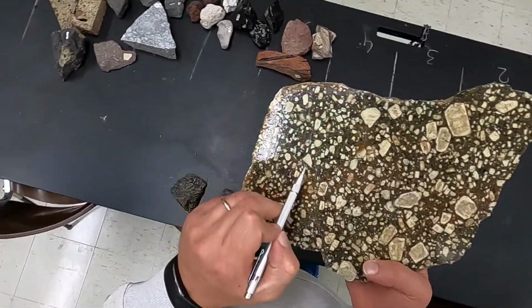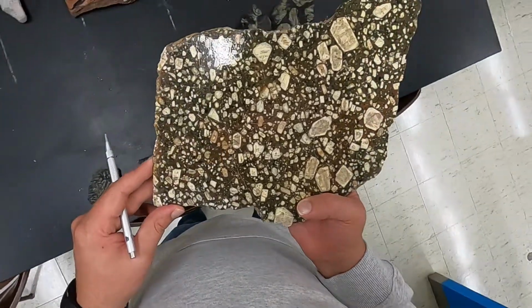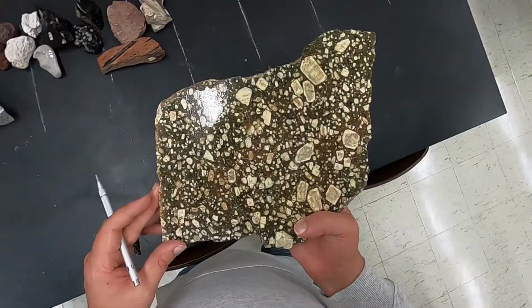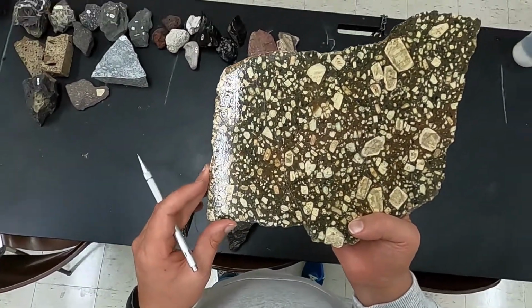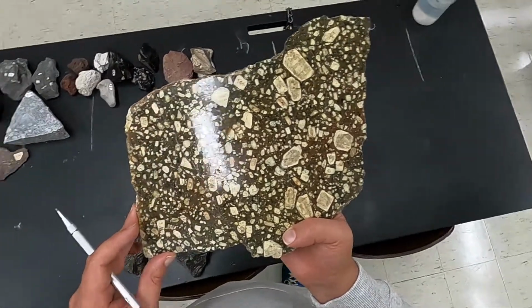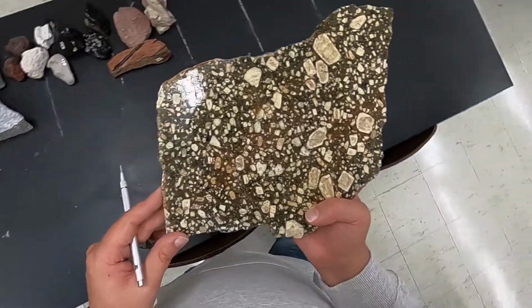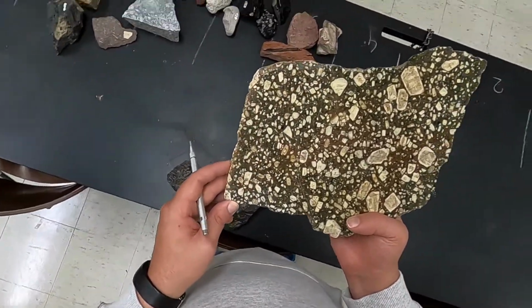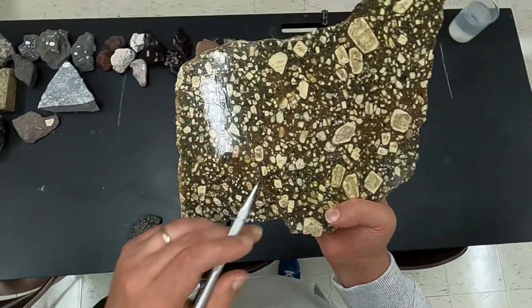I don't see any elongated section. And this is because of the way you break biotite. So biotite quite often will break along the single cleavage, and so it tends to form fragments that are essentially small layers, or thin, more correctly, thin layers. And so that's why you lose completely those squared sections that are more typical of pyroxene and amphibole. So that's an important observation to make.